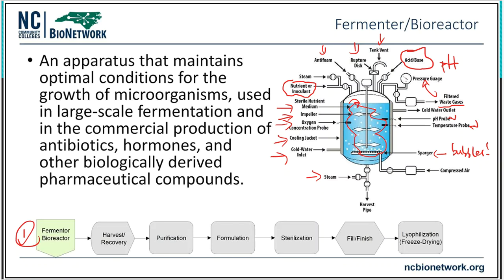We're going to have to talk about them in little bitty pieces, but I hope that I give you an idea of what these fermenters and bioreactors are basically doing. These are big vats, and these vats have living things on the inside of them. And we have to take care of these living things to make sure they stay alive, so that way they can keep reproducing, they can keep multiplying, and they can keep producing product that we are after.